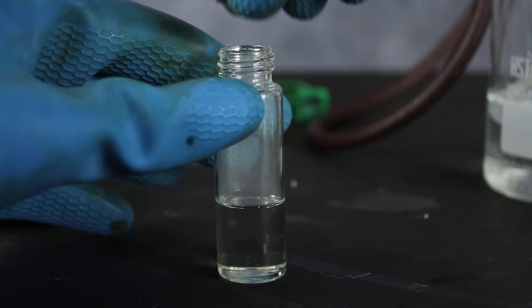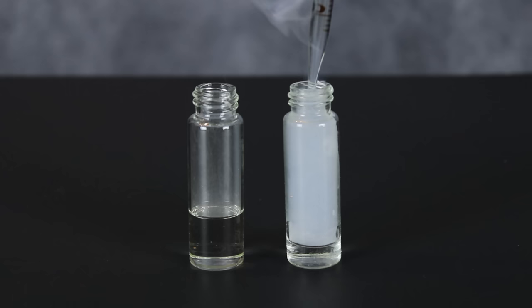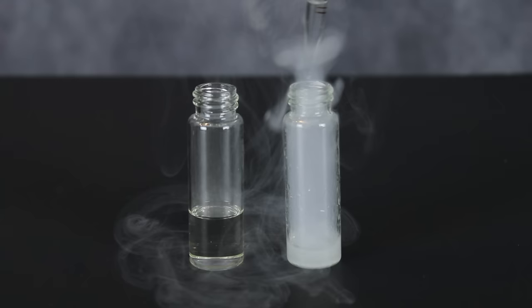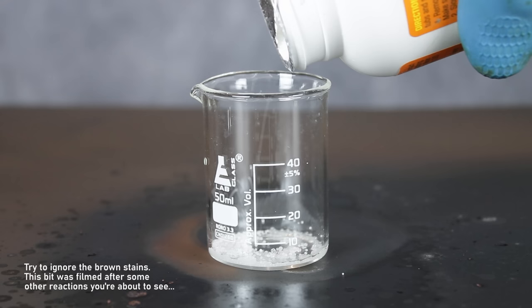Now, since this was my first time working with a super acid, I figured I would start the reactions off with something fairly tame: household ammonia solution. As expected, the chlorosulfonic acid immediately boiled and fumed angrily on contact with the ammonia, showing just how reactive this stuff is, even with a weak base.